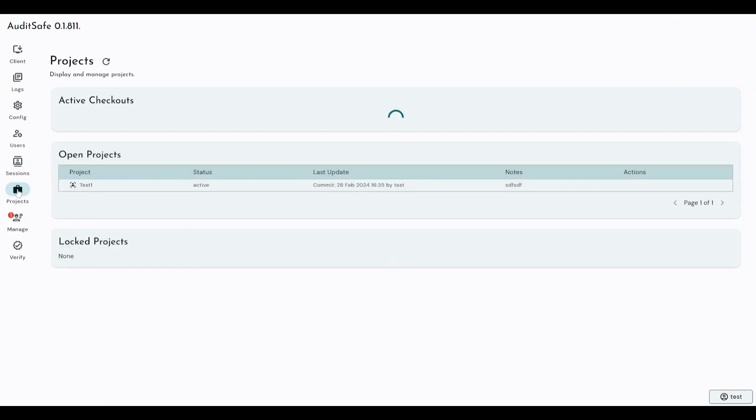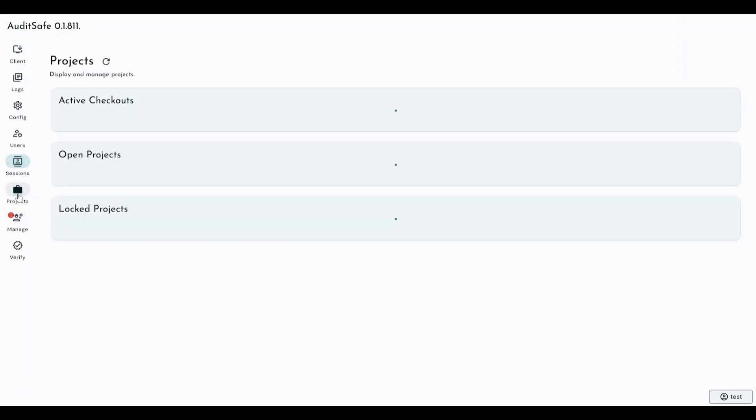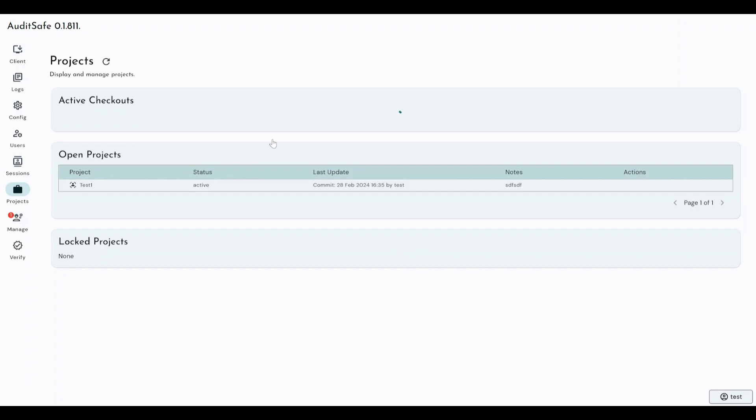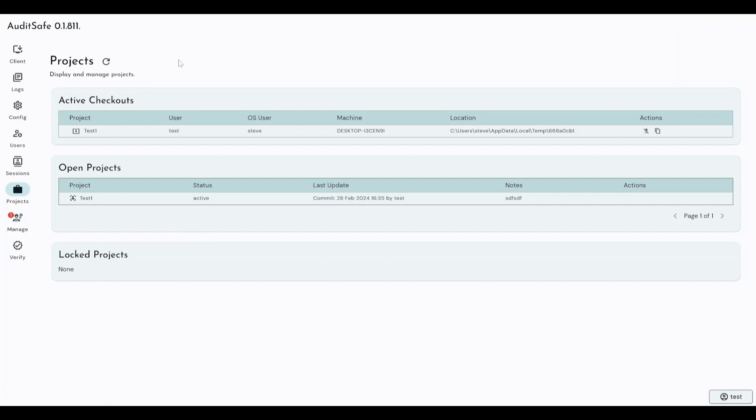Projects is very similar to sessions, but at the project level. You can see all of the projects that are actively checked out, and cancel those checkouts, and get details of those projects. You can see all the users that are currently working on different projects, and I don't have any locked projects, but if I wanted to, I can see all of my locked projects. So you can get a kind of bird's eye view on all of the data that is within the system through the projects tab here, through the URL, through the browser that you're centrally managing the Auditsafe software with.